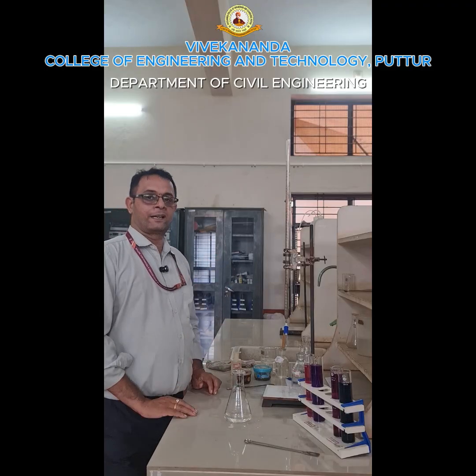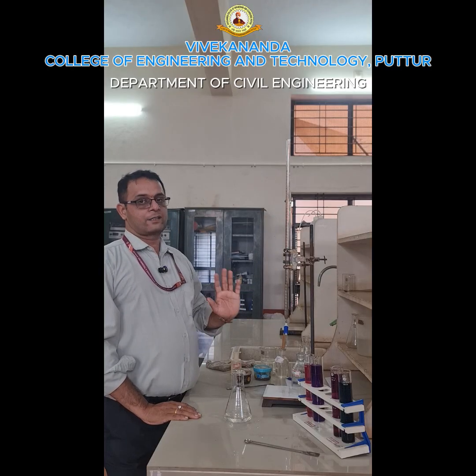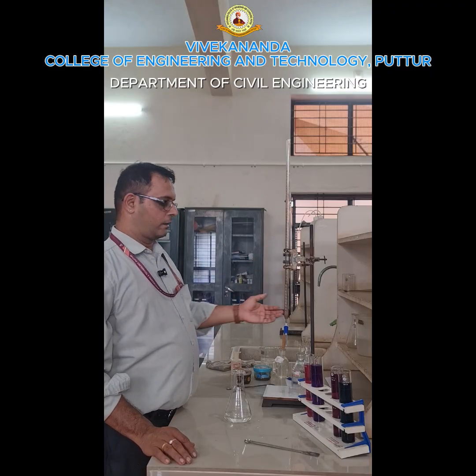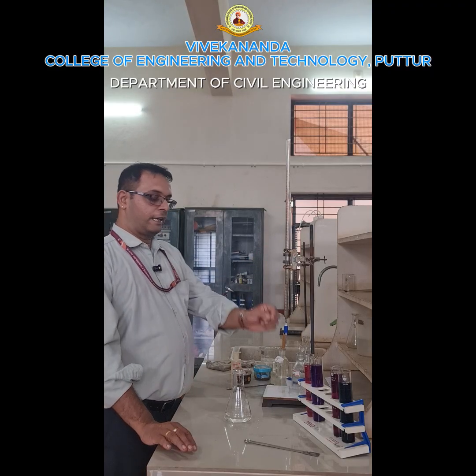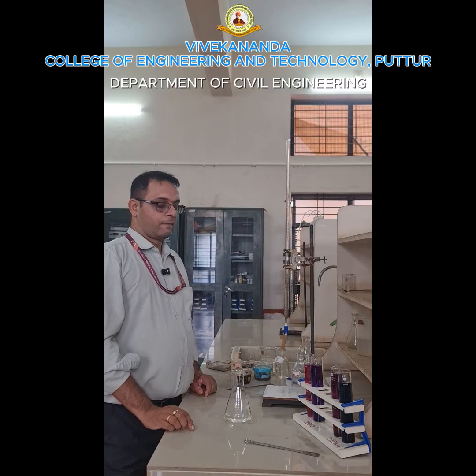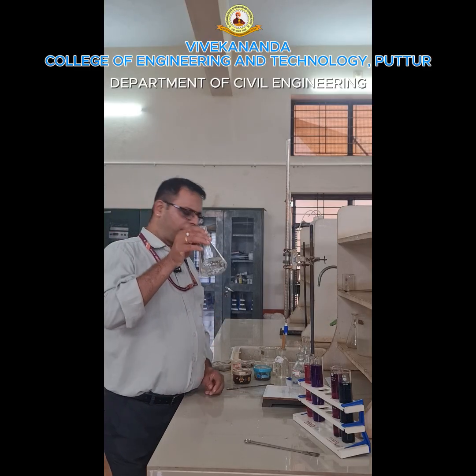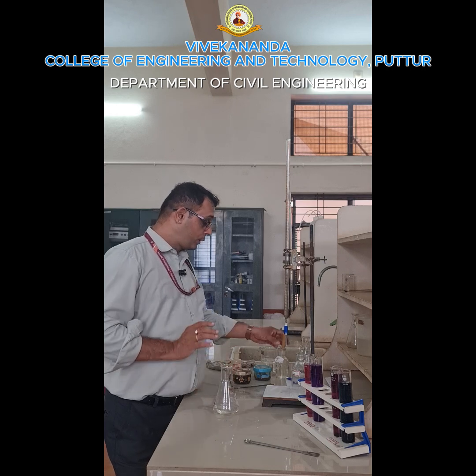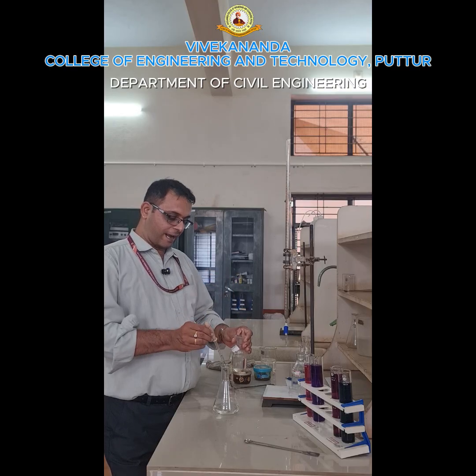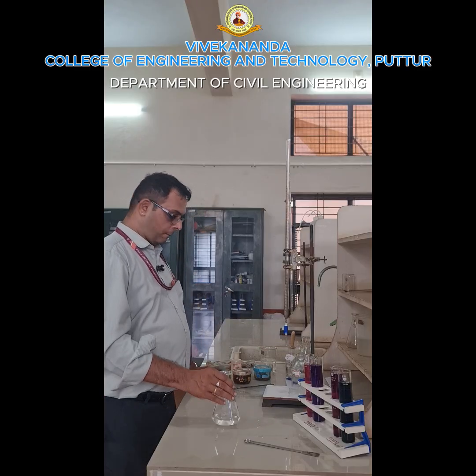For the calcium and magnesium, the initial setup I will do the same, that is, total hardness you should know. For the total hardness, you have to take the sample, add the ammonia buffer, then EBT, wine red to purple at the time of titration. Now for the calcium hardness, once again I will take 25 ml of sample. Now you have to add 2 normal NaOH. Once again it acts like a buffer solution to maintain the pH.